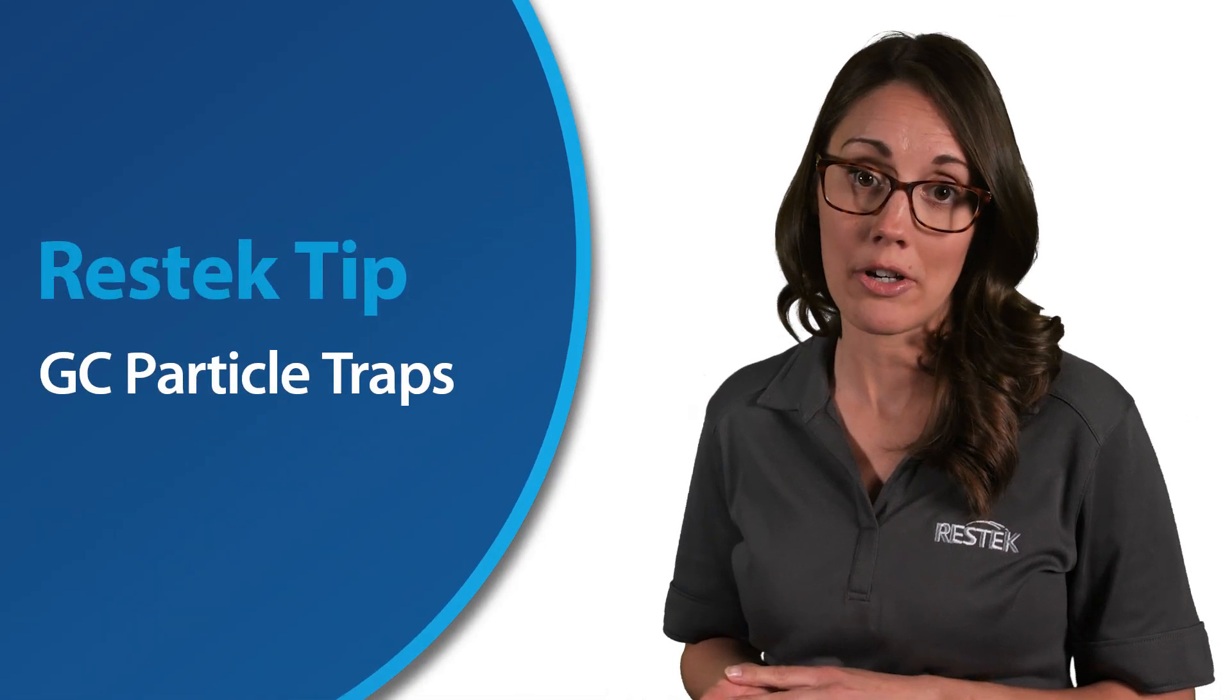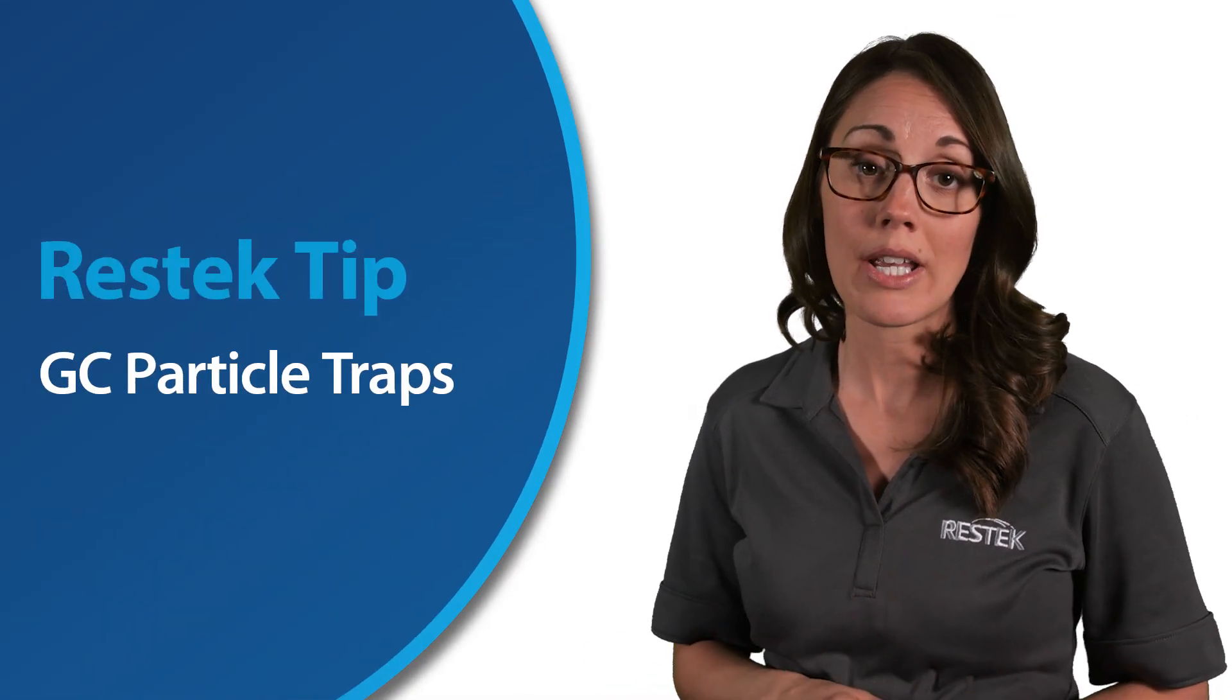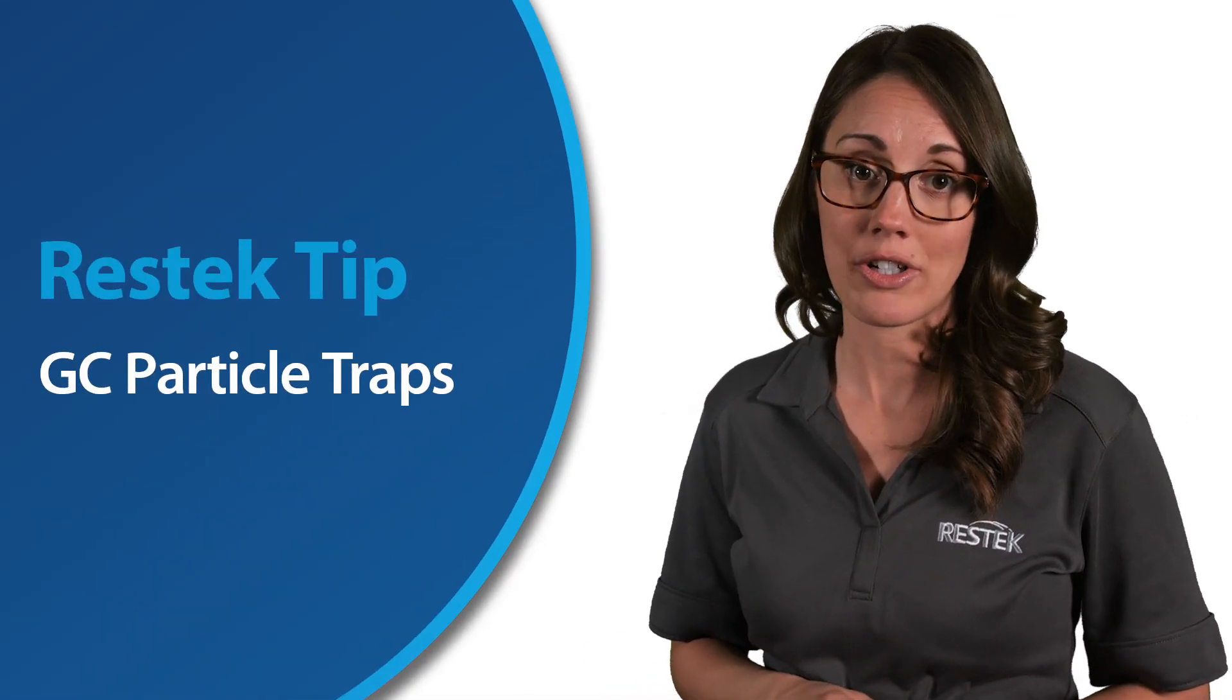In this RESTec tip, we're going to look at connecting a GC plot column to a particle trap using a press-tight connector. Let's begin by exploring what a particle trap is and how it works.